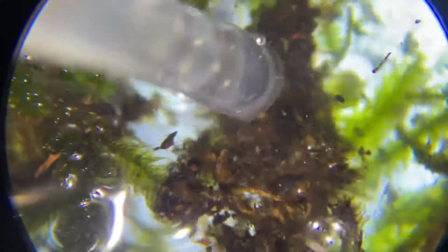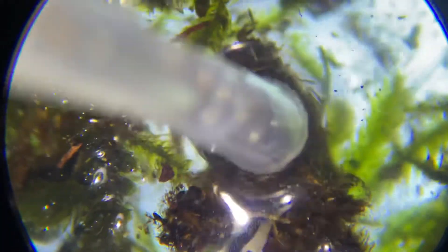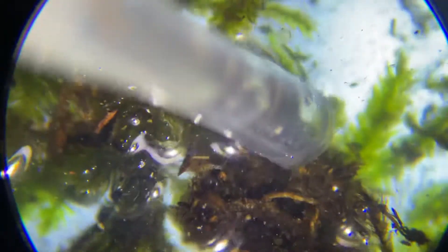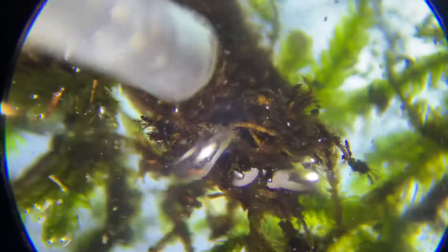Sometimes it works and you get a good tardigrade, and sometimes they're not there. I'll zoom out and blow some air in to swish it around. Some people are very delicate with their samples — I've never had any trouble, I've never found a dead tardigrade. In this mud here, in this little piece of root system, a tardigrade would be easily visible — you'd see it moving. It would be about as big as that little golden thing I'm touching right there, at this magnification.